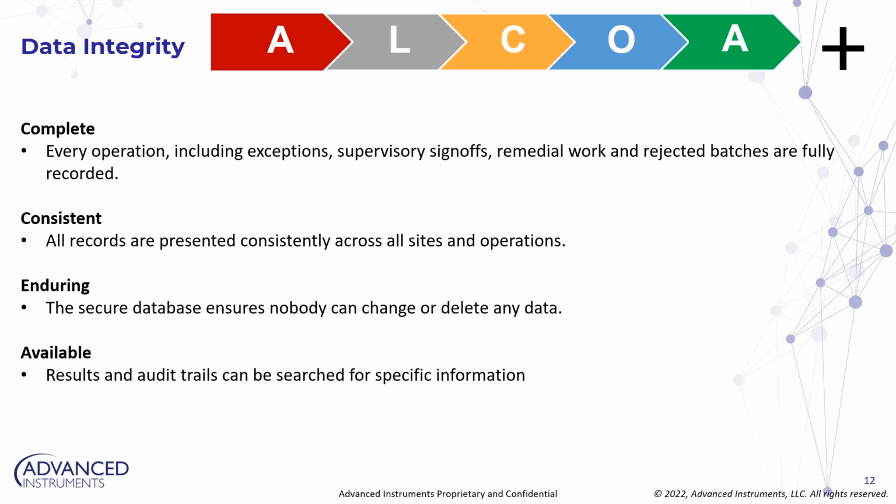Consistent. Consistent is really something that's used across not just one site, but multiple sites. So if you have multiple instrumentation, are all records that are presented consistent, right? So if there's supposed to be this format, this specific structure to how that data is presented, the way the data is tracked, is that consistent irrespective of changes in location, in regions, or software changes or anything like that, right? Is the data always consistent as a whole?